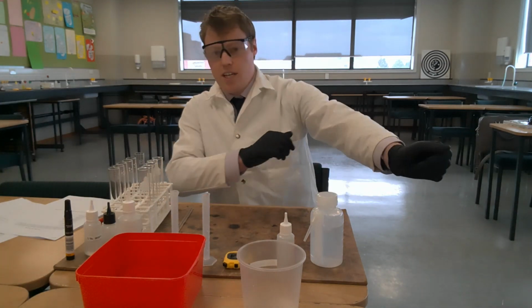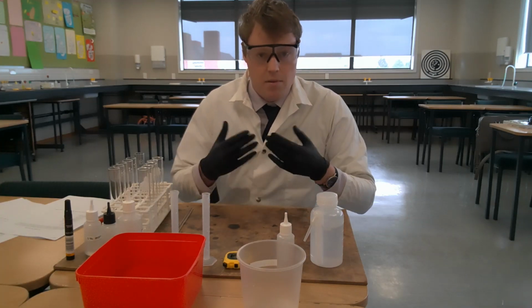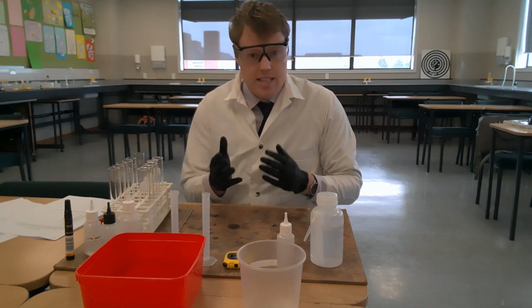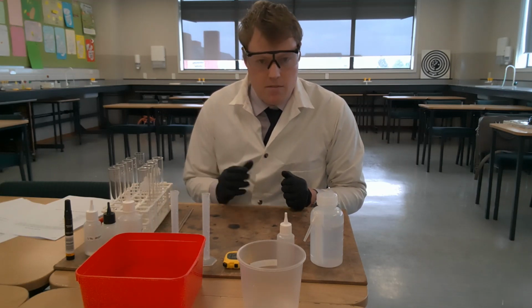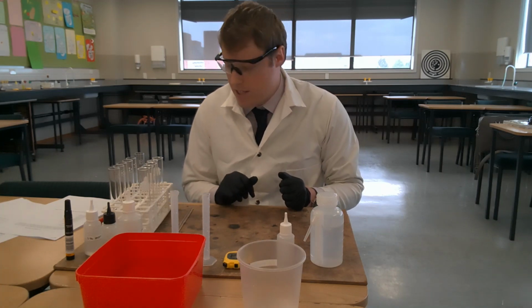There are two reasons you need to watch this video. One is to collect the data that you will use to do your results table and your graph and your analysis. And the second reason is for you to get a good sense of the strengths and limitations of the experimental method that we are using.